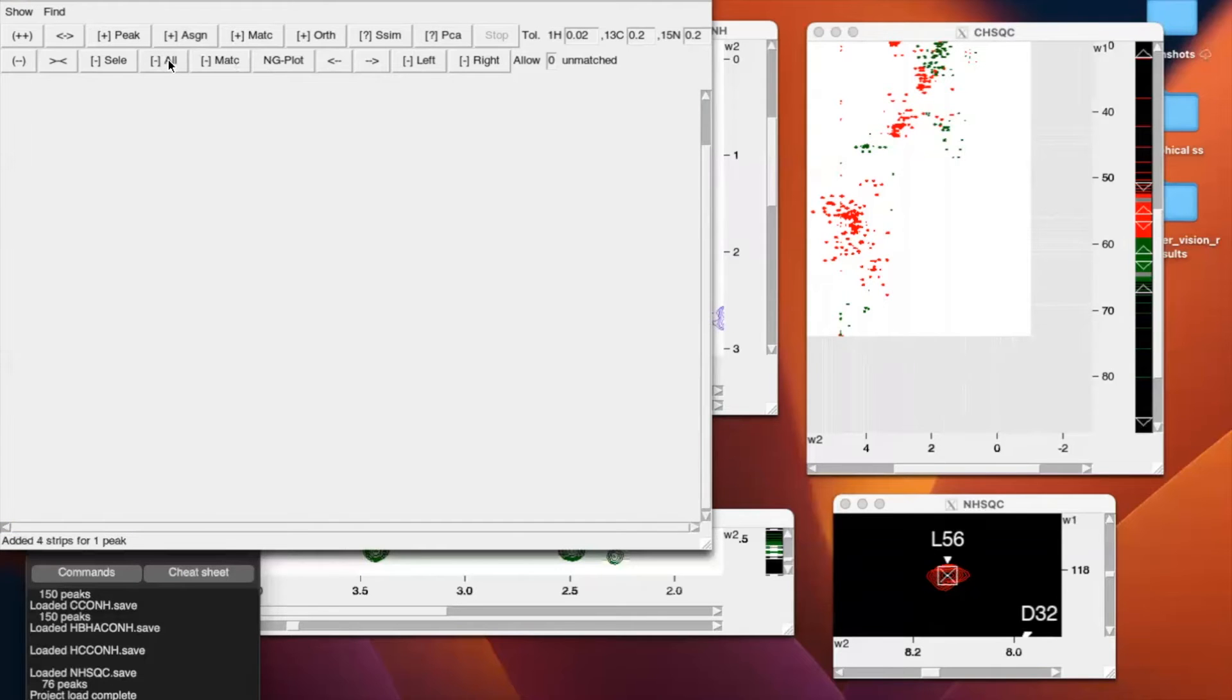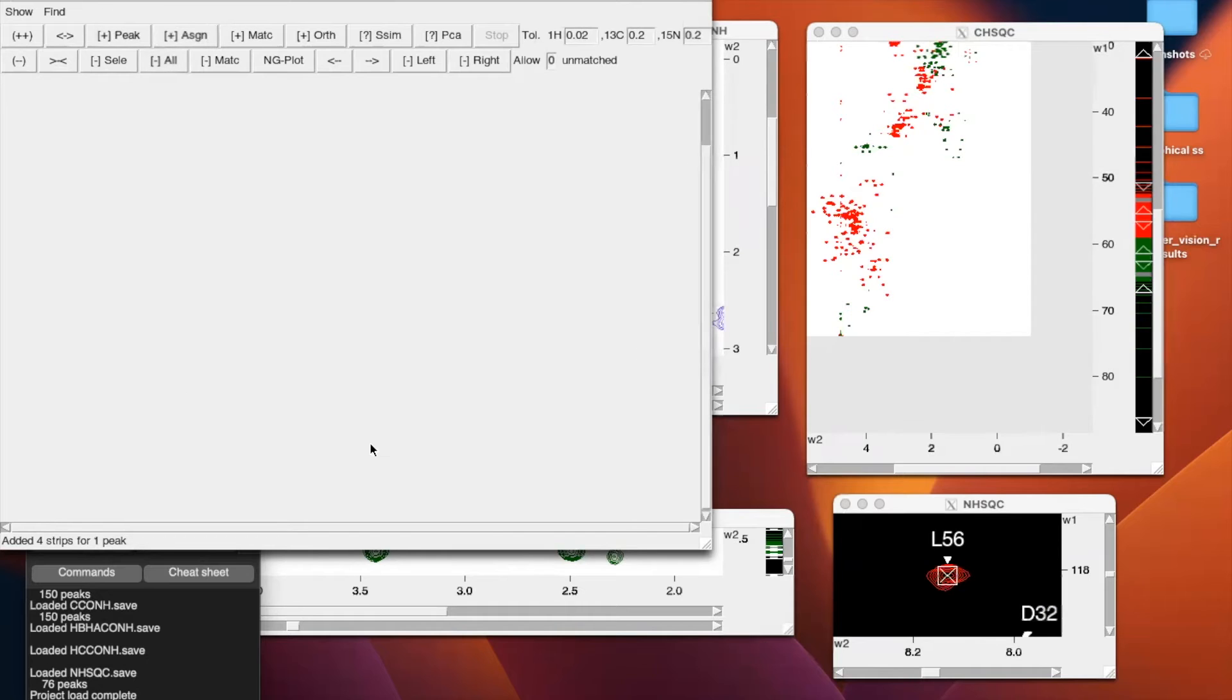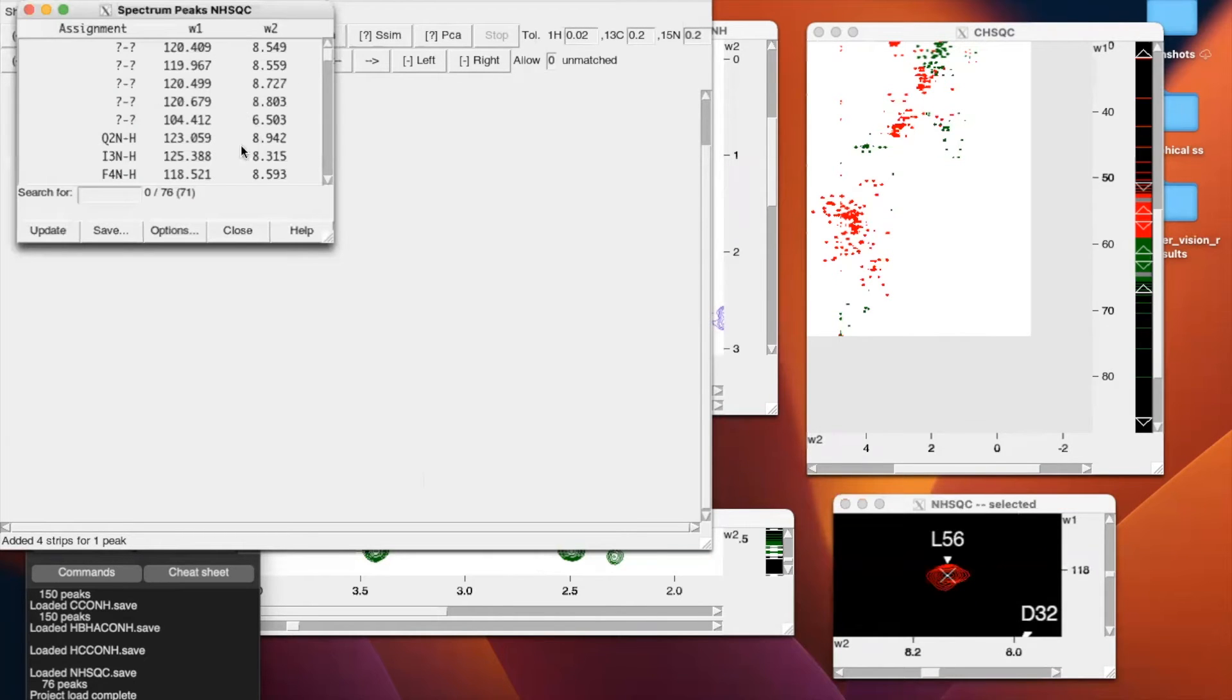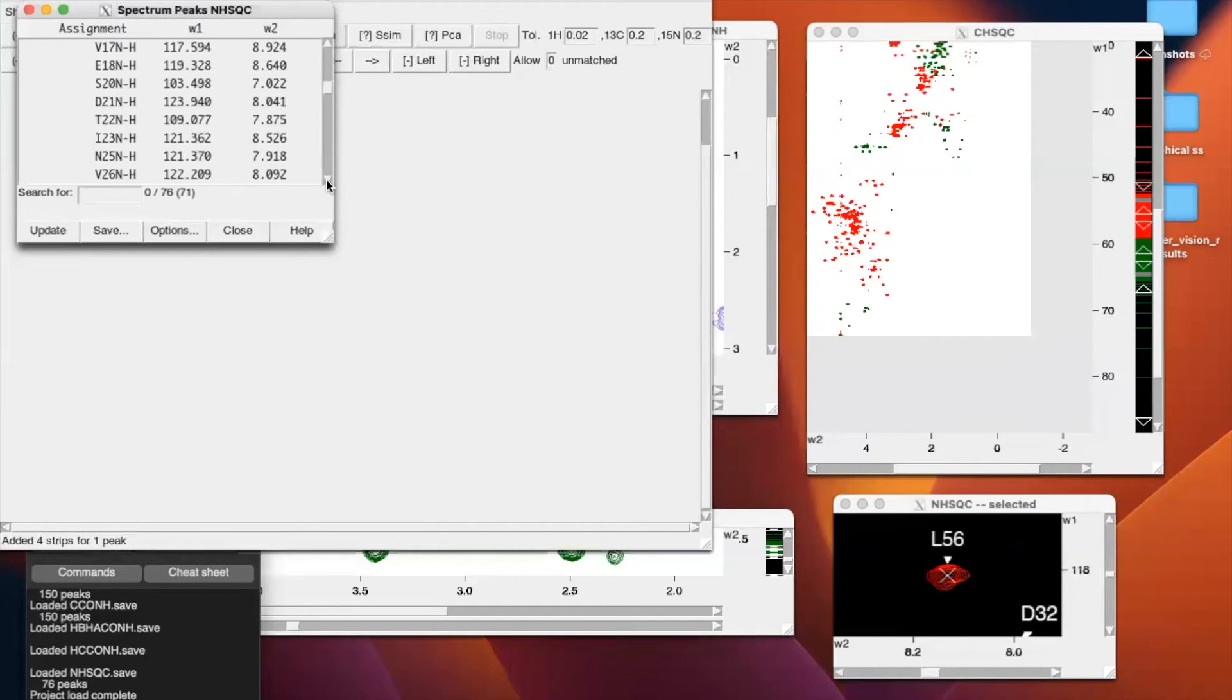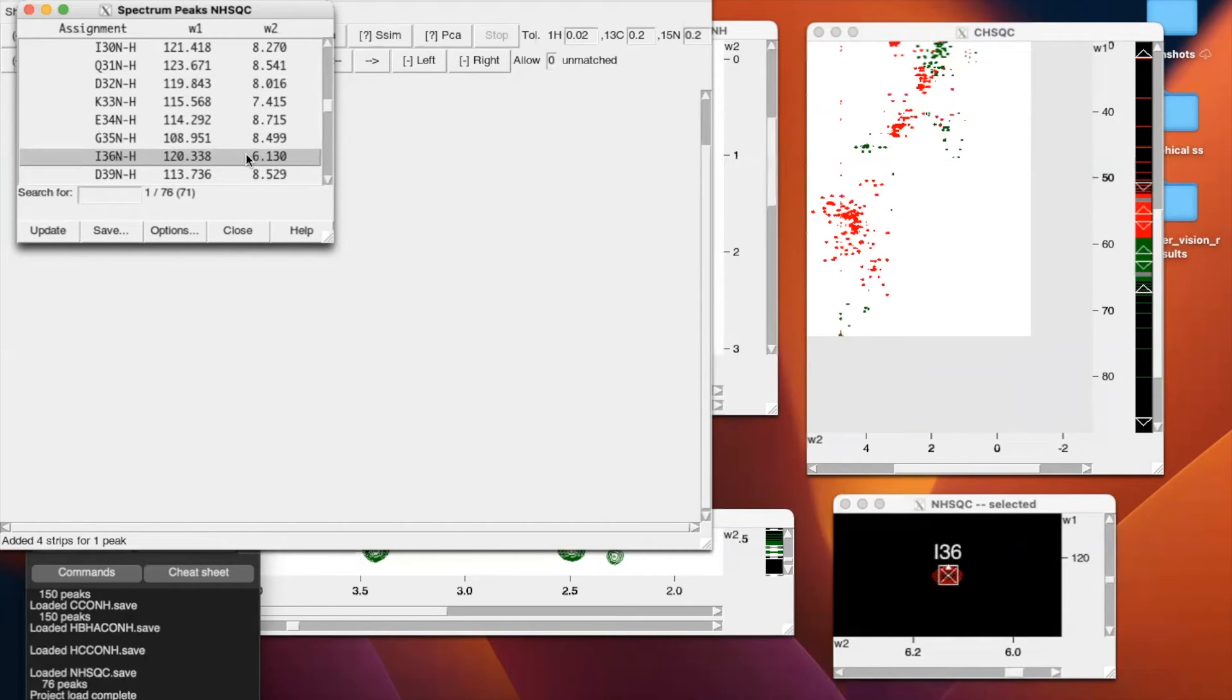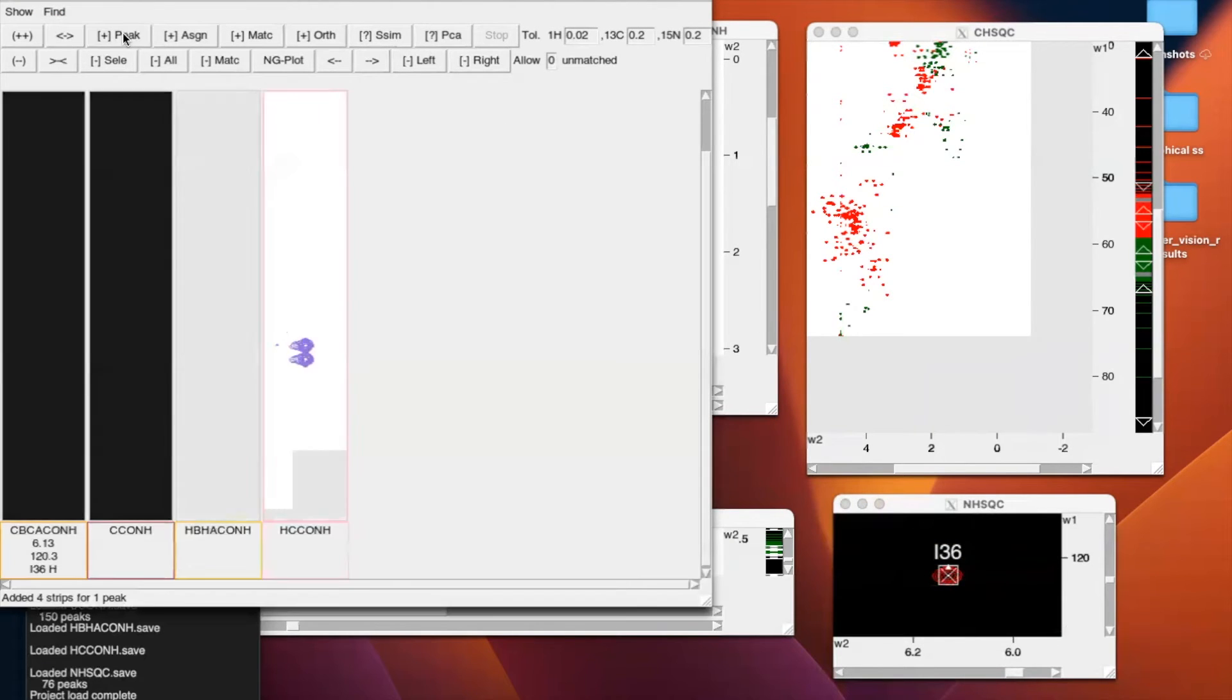So let's get into our two examples that we're going to be walking through today. We're going to do first glycine 35. So now that we're all set up to manually assign, we're going to go to our NHSQC and enter the two-letter code L-T. This is going to give us a list format of all the assignments that we can interact with. So in order to manually assign the sidechain for glycine 35, we have to select residue 36. Once we double click, it'll be selected and we can add that peak to our strip plot.